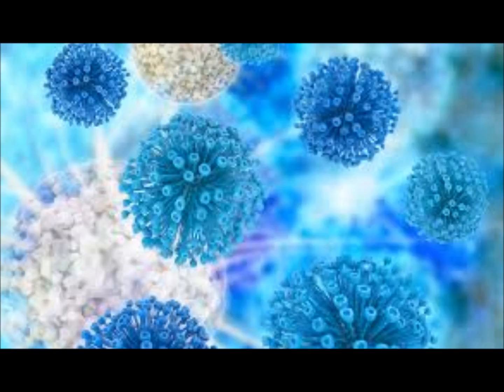So your first week in micro, probably your first day, you're going to be what is called the setup bench. You're going to be the one plating them on the media that the techs will look at the next day. You'll be the one preparing the gram stain on whichever ones get gram stains. Not every culture, usually urines and throats don't get gram stains. Sputums, not even all places do genital gram stains.